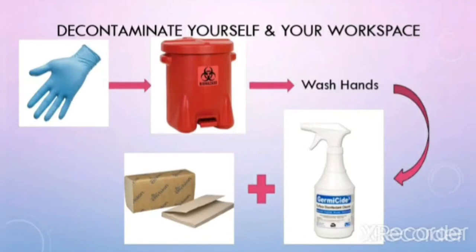Once you are all done, decontaminate yourself and your workspace. First, dispose of your gloves in the biohazardous waste container — your gloves have been contaminated from the experiment you've just conducted. After that, wash your hands thoroughly, then use germicide and paper towels to wash down and wipe up your workspace.